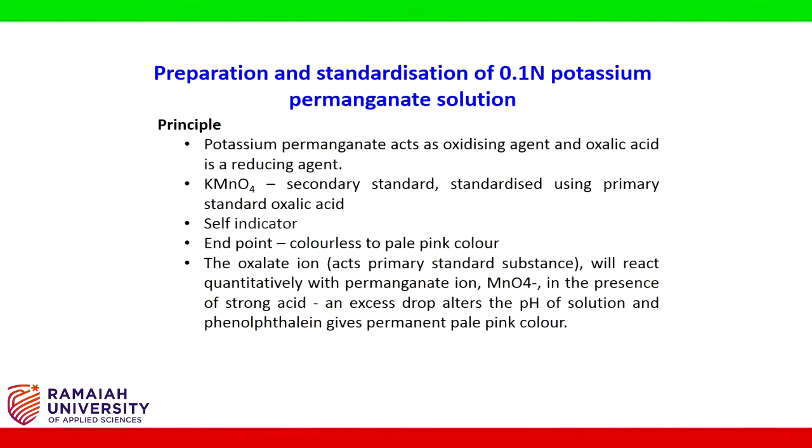Permanganate ion, in the presence of strong acid, an excess drop alters the pH of the solution and gives a permanent pale pink color.